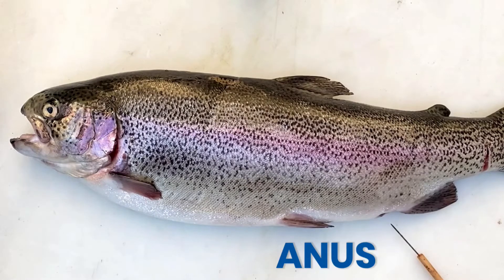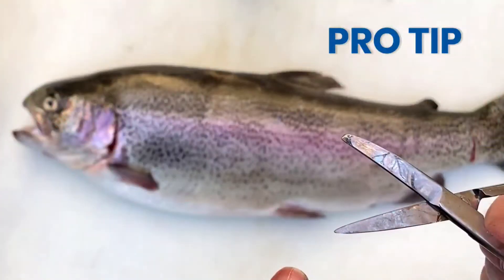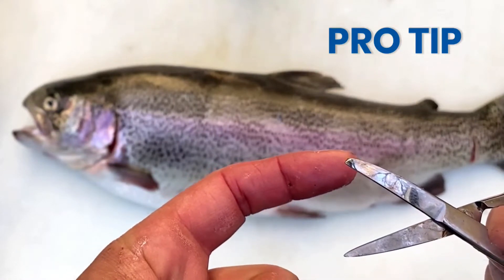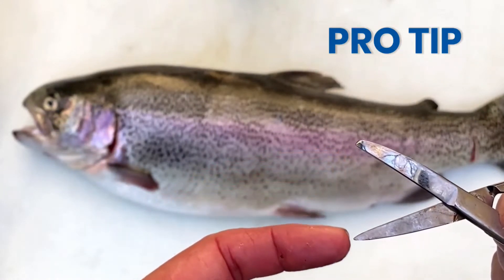For those doing your own fish dissection, here is a pro tip. Be sure to use the blunt edge of the scissors when cutting into the body cavity to prevent organ damage.